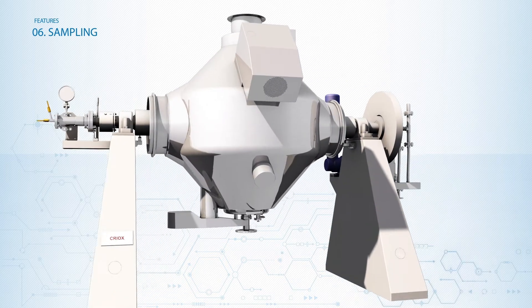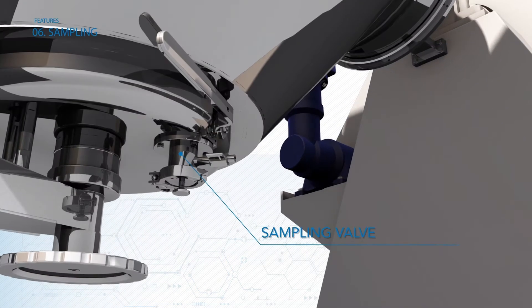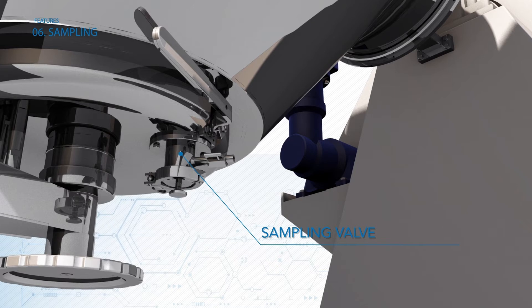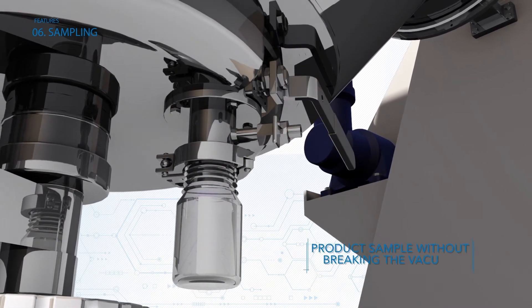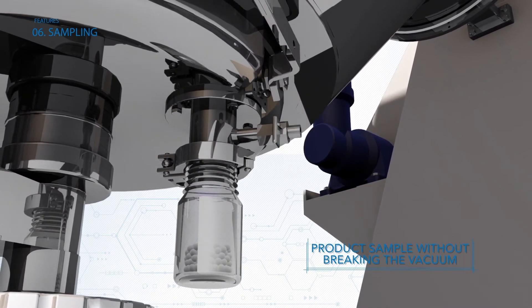Thanks to its sampling valve, it's possible during the process to extract product samples without breaking the vacuum and to vary at any time the process parameters in order to define the ideal drying path.